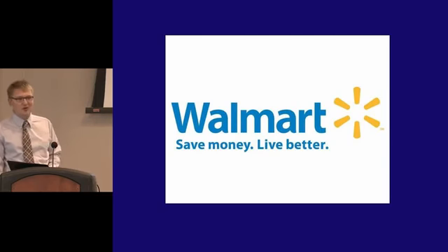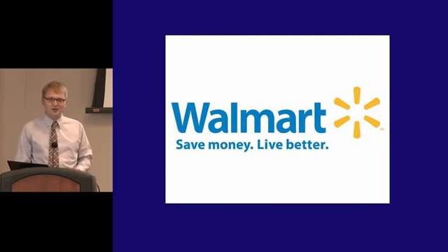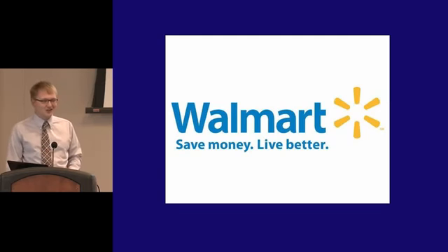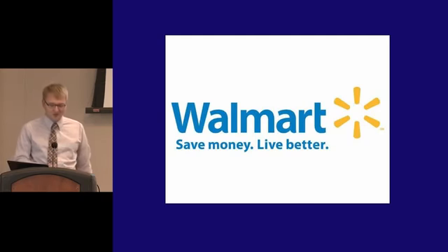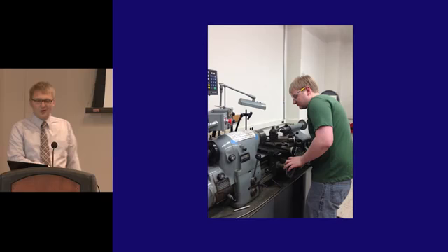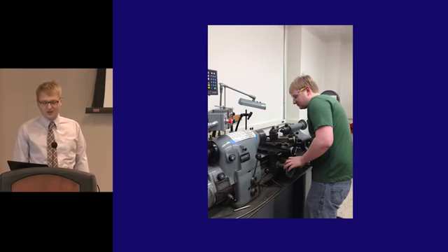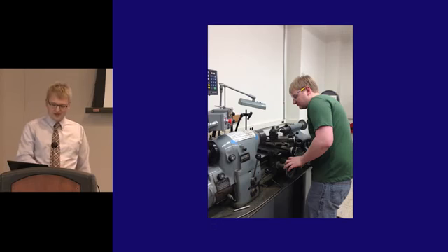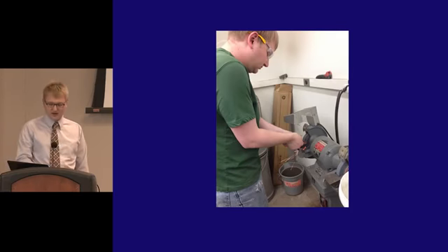So here's the real problem. If you want your very own magnetic bottle photoelectron spectrometer with electrospray ionization, you can't just go out and buy it at Walmart or order it on Amazon Prime. You have to build it. So here I am, hard at work, constructing a focusing lens on our chemistry department lathe. Here I am grinding a tool to cut the O-ring groove that we're going to use later.